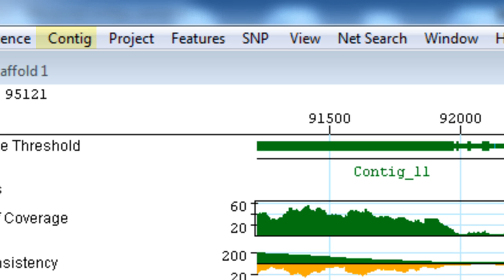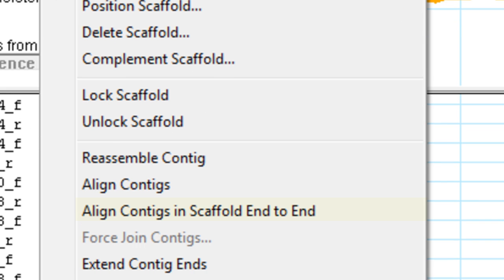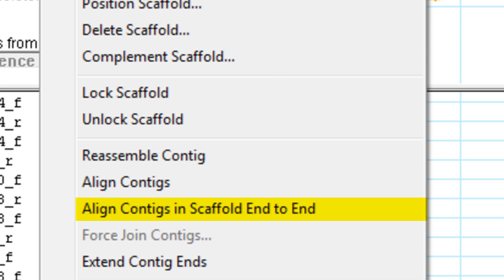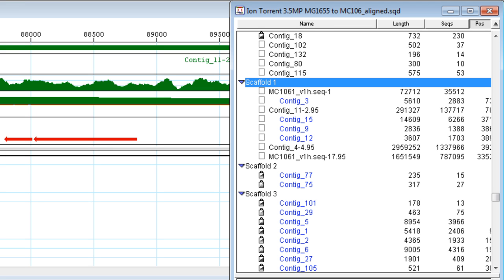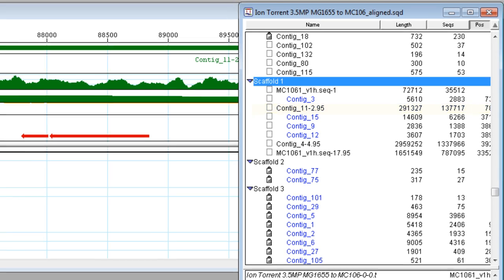I can then align my contigs by selecting Contig, Align Contigs in Scaffold End to End. After aligning contigs, we can see that we were able to merge contig 11 with this larger contig.